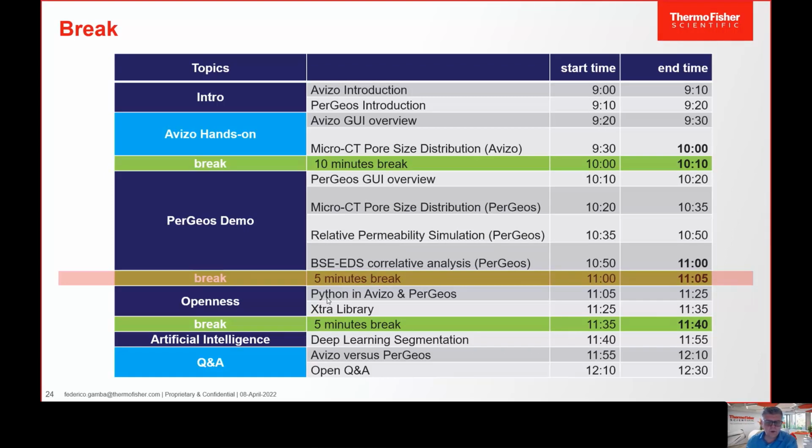In research, you always want to do things that nobody thought about before. So being able to extend the software with something new, with your science, with additional blocks, is a strong demand. Recently, Python has been the most used language to do that, and so we will see how to do it.